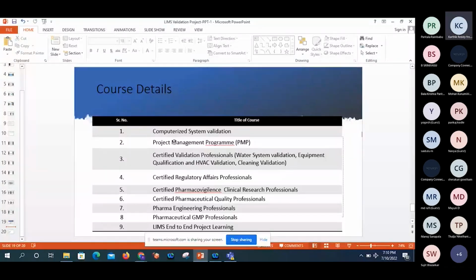The IT person who is available in the company should be trained properly in a strategic way by the vendor. Okay, so the vendor can give the training to people. Initially, for example, subject matter experts are available from cross-functional departments like QA and warehouse, and those people can be involved as a core team for development testing.